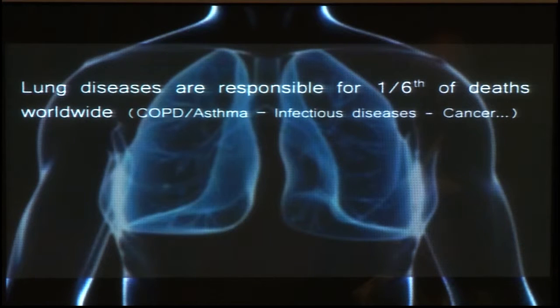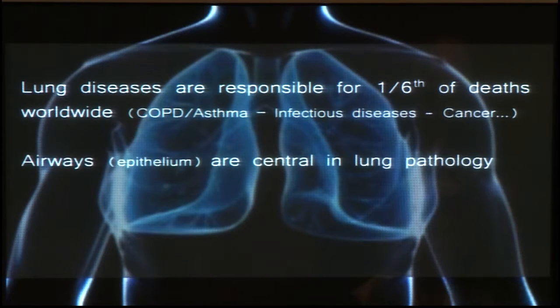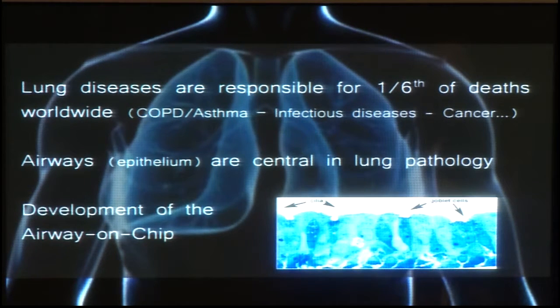Some partners, some collaborators we have were interested in specifically mimicking and testing drugs for COPD and asthma and some infectious disease. And for this disease specifically, the airway epithelium is central for the lung pathology. So we started, when I arrived, it was 3 years ago already at the Wyss Institute, to develop this airway on a chip that would recapitulate what you have in your airway epithelium.